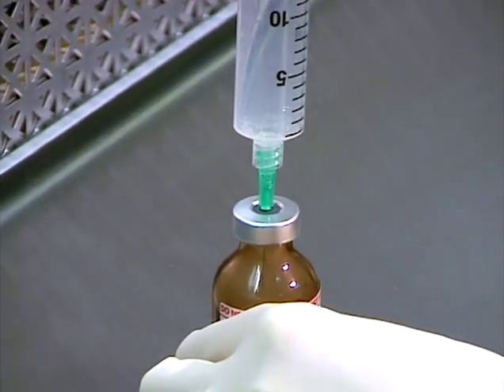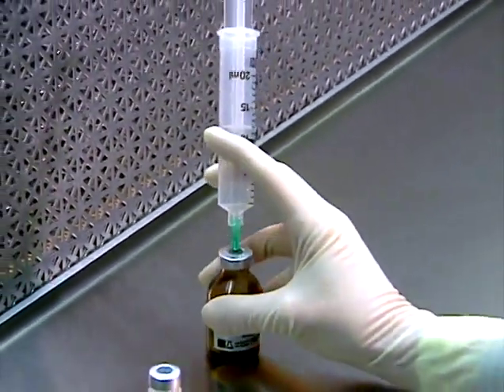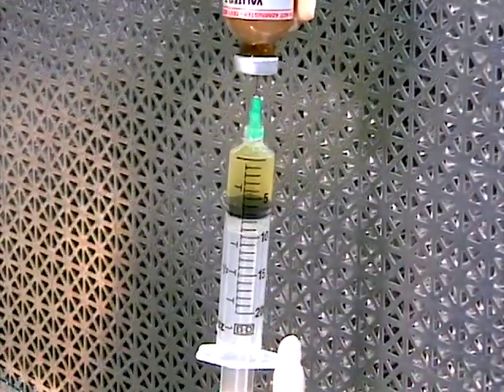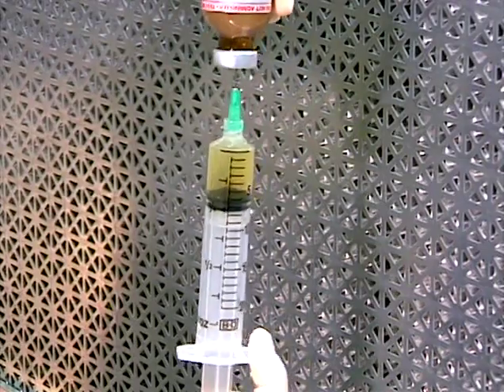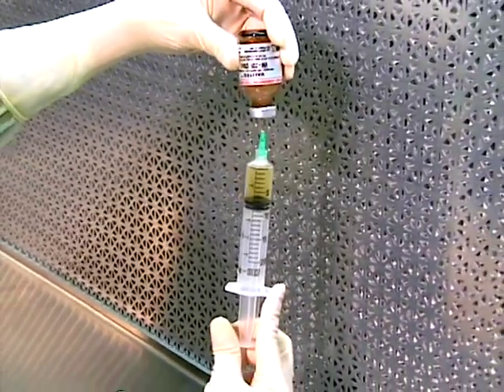If the vial syringe assembly must be shaken periodically to effect complete dissolution, do so gently, keeping the critical site in first air, away from other compounding activities and critical sites. If a dose is to be drawn up immediately following complete dissolution of the drug, invert the assembly and pull back on the plunger, seesawing the compound back into the syringe, and make the final dosage adjustment. Remove the vial slowly from the needle.